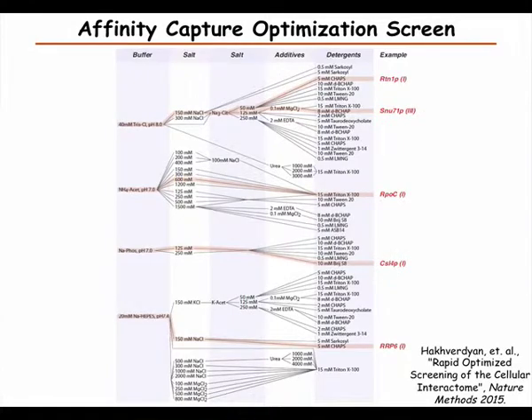That's the idea. The other thing is that one of the figures from the paper shows a few complexes, and as you see, the optimal condition for these complexes is quite different when it comes to the buffers, salts, and detergents. So it's definitely worth exploring the space of conditions, and it's usually done manually.